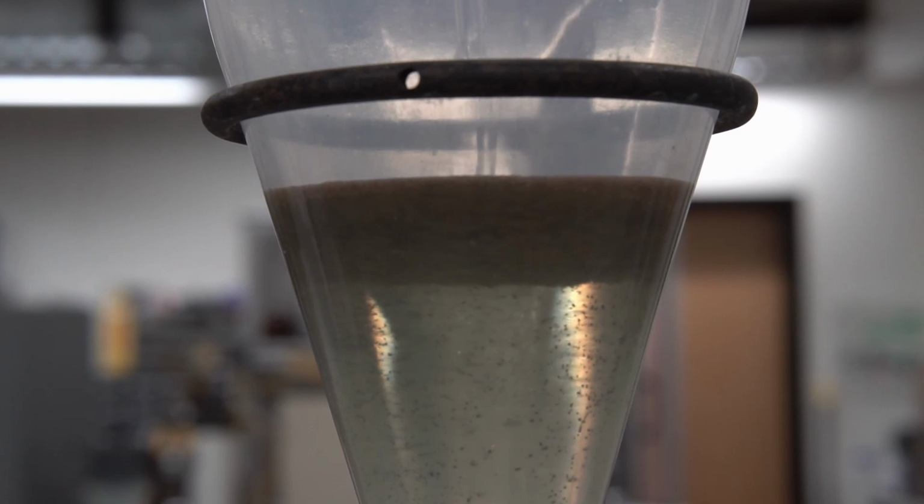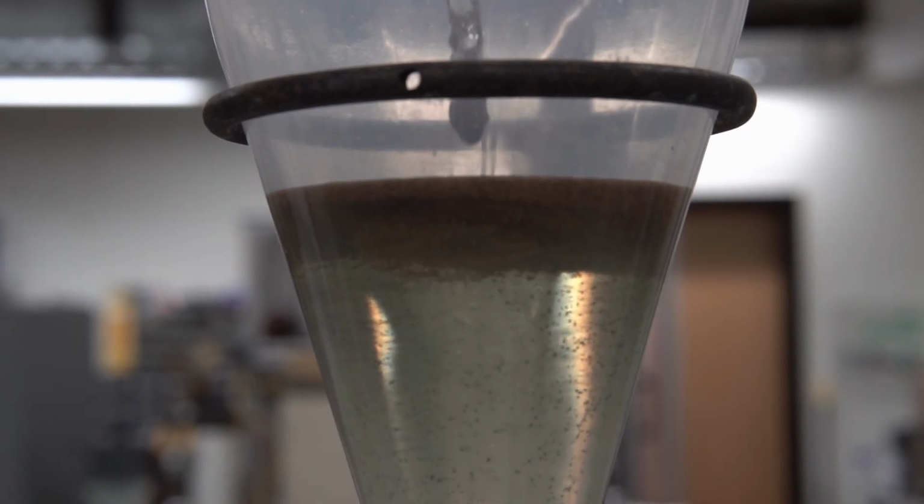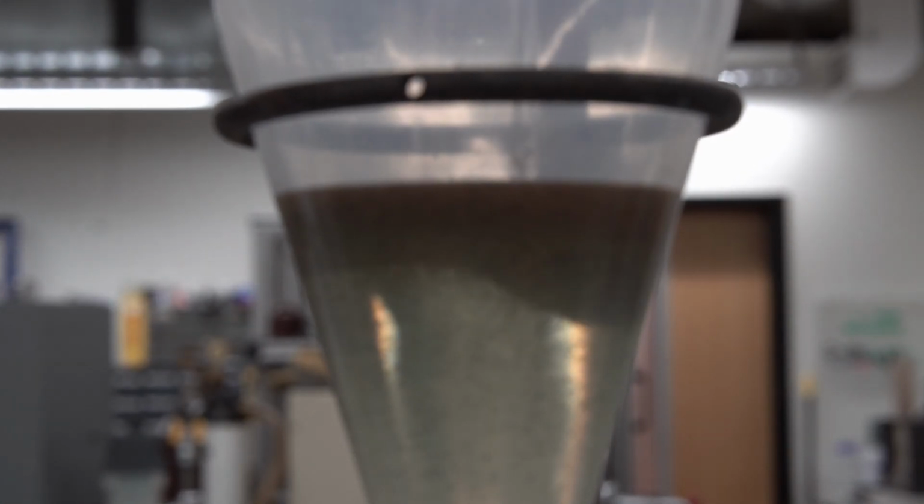Additionally, it's also less viscous than some of the other heavy liquids, which makes it really nice for doing dense media separations because you won't have as much of a surface tension effect on your particles.